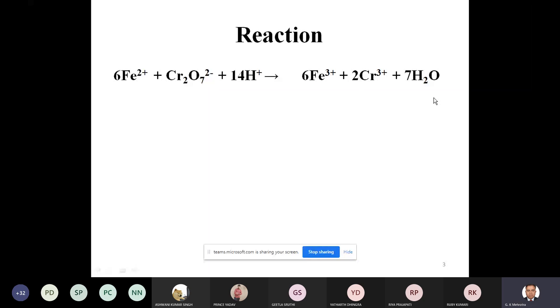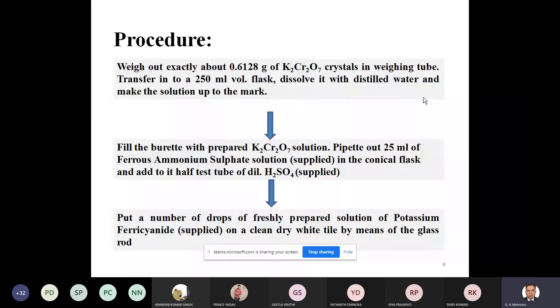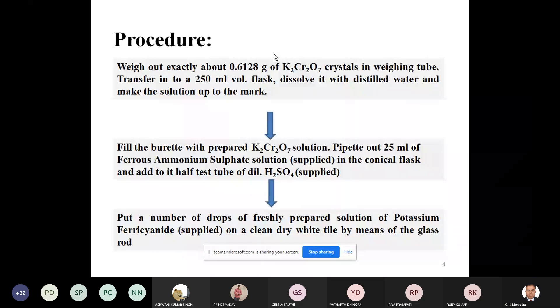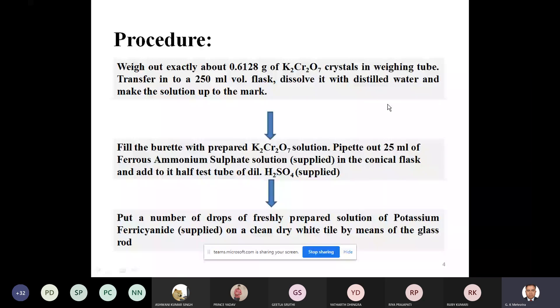The first part of the procedure is to prepare a known solution of dichromate of approximately N/20 strength. The calculated amount is 0.6128 grams of potassium dichromate in a 250 cc volumetric flask. Simply weigh it, transfer to the 250 mL volumetric flask, dissolve in a minimum amount of distilled water, and make it up to the mark. That solution is then ready for use.